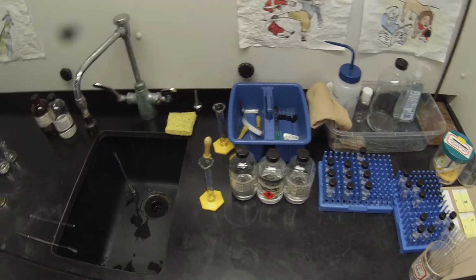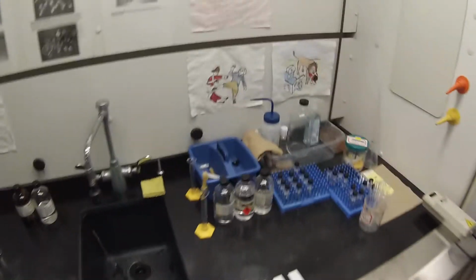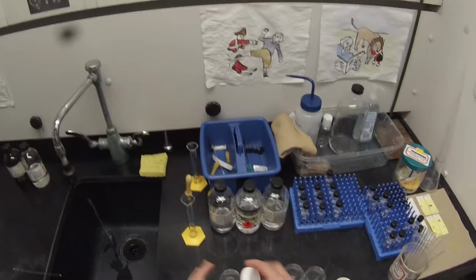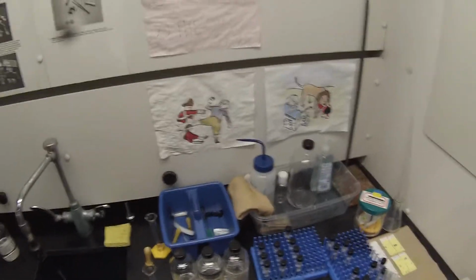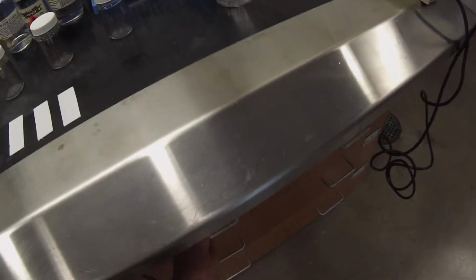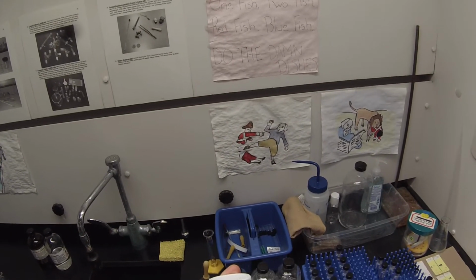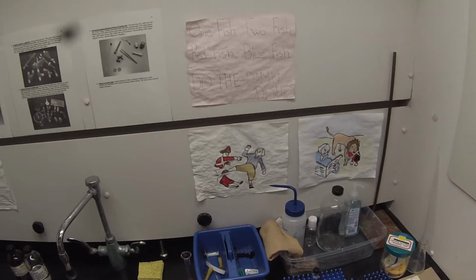So we need to figure out what we're going to run these TLC plates in, so we know what solvent mixture to make up. So we'll have chambers, our TLC chambers, screw cap jars here. And we'll probably need a different solvent mixture for each compound. So I'm going to label these V for vanillin and Ca for cinnamic acid and T for tryptamine.